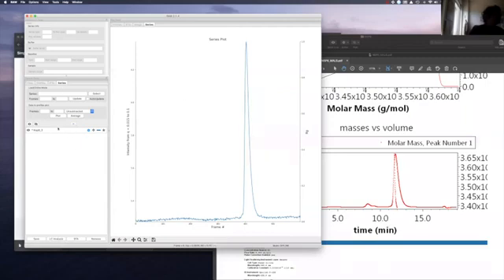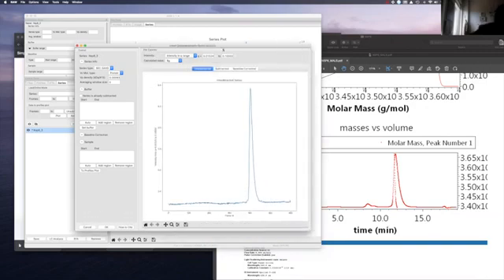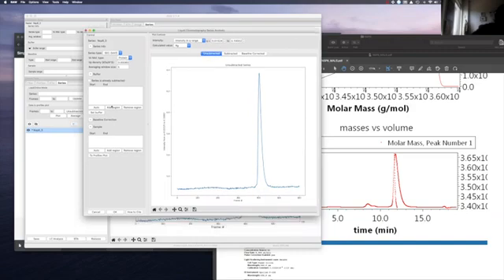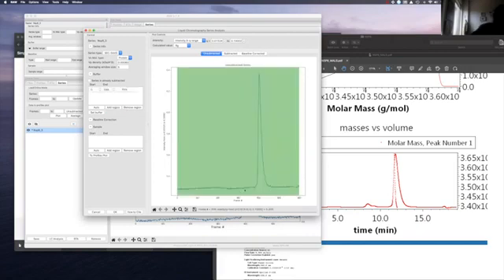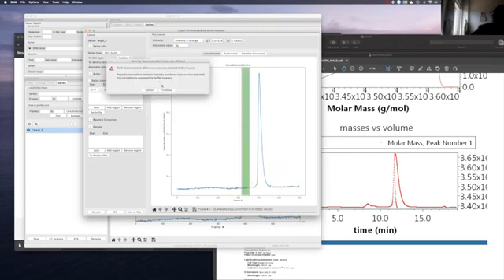If you click on this series here, as Steve mentioned, you can go to LC series analysis. Here what you see is the same as what you've seen before, but now we need to adjust the buffer first. So let's add the region of buffer. Obviously, the buffer in front of the peak is the best selection. For this peak, the buffer could be affected by some small molecules at the side, but I don't have the problem here. There is no dip or anything, it's a little bit far away, but still, to be sure, just pick the buffer from here to here, set the buffer, and continue.